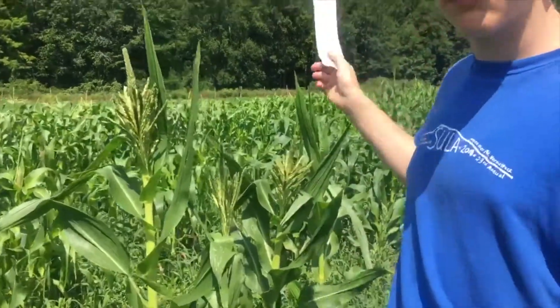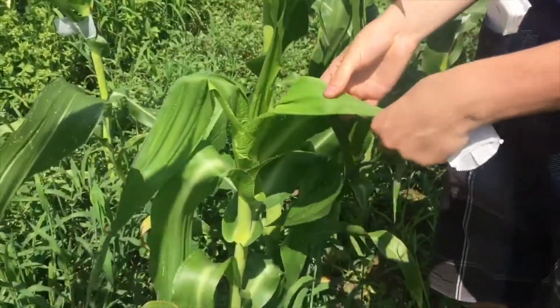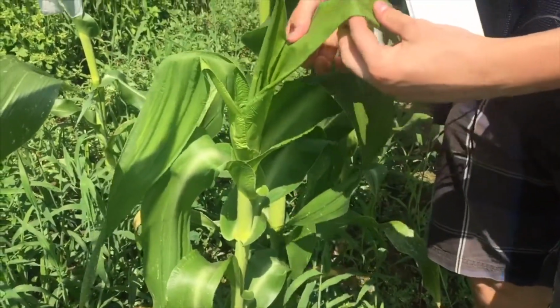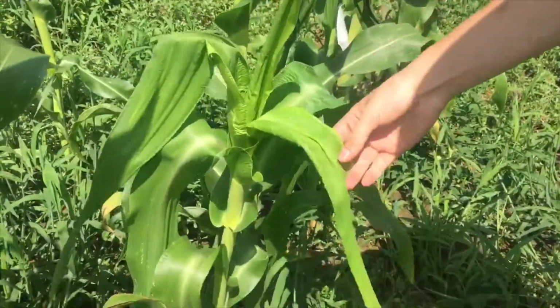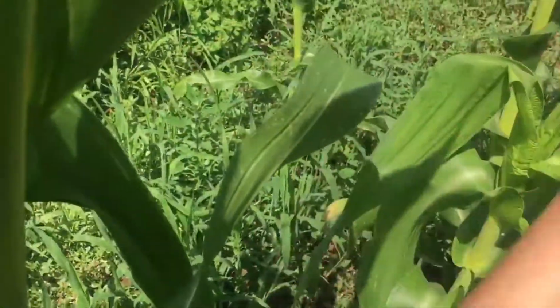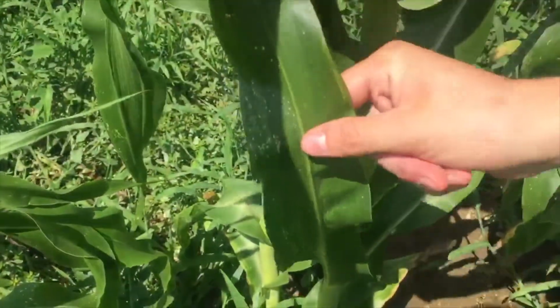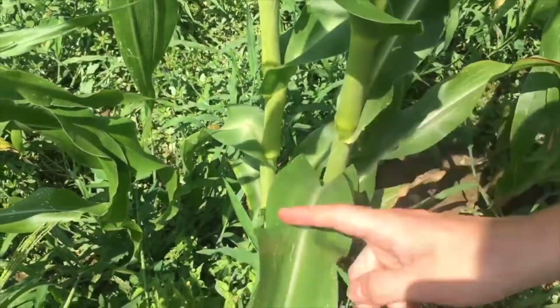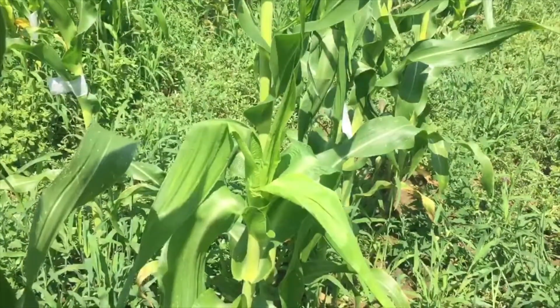Right, so we're out in the field. Here is a drooping leaf double mutant. Since two of its genes are knocked out, it just doesn't produce a midrib in its leaf, and so its leaves are drooping. You can see the phenotype there. Whereas in the wild type, it has a very pronounced midrib that will break if you bend it, and you can see how the phenotype is affected by how we mutate the plants.